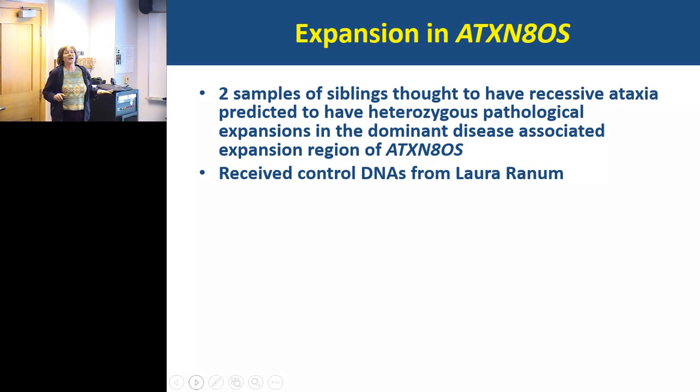And just for those of you who want to do wet lab work, Aaron initially said, this is a false positive, I can't amplify this. And I'm a stickler on these kind of things. So I said, well, we need to have a positive control before we can say with absolute certainty that we could not detect this. So we received control DNAs from Laura Ranum from Minnesota, who has basically identified this gene, where she said, OK, this is a sample with 60 repeats. This is a sample with 200 repeats, et cetera.